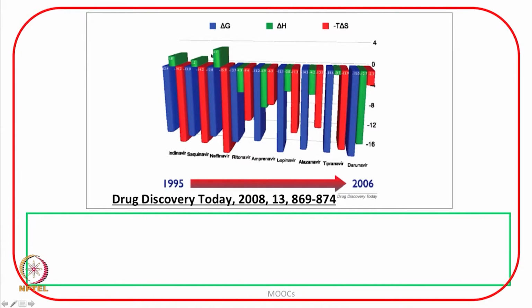See, it changed from endothermicity towards exothermicity, and this trend suggests that over this period the new molecules have shown a trend changing from endothermicity to more exothermicity.